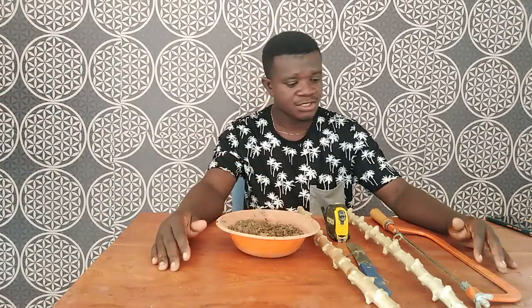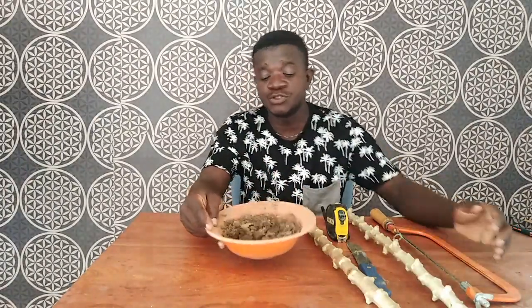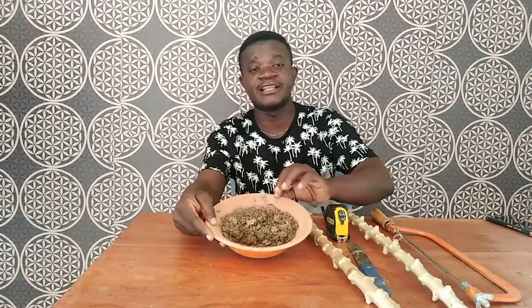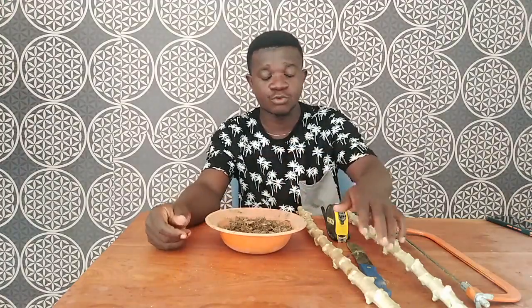In our previous videos we performed the whole experiment for you. Today this is going to be a very detailed video for you to get a full understanding. What you see here is sawdust — this is the substrate. That is what you are going to use for our multiplication here. This is sawdust, which symbolically represents the medium. If you want to plant directly or use a nursery for your cassava, you can do either.